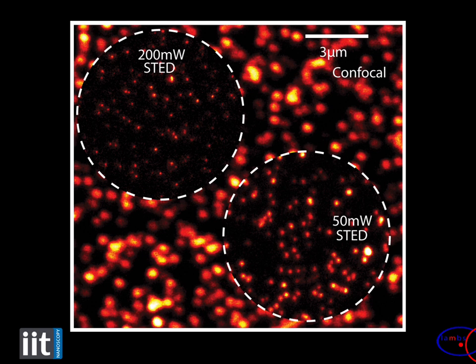One of them, since I'm from Genoa, is the cost of the laser. If you have to put a huge number of photons, you need high-cost lasers, and you cannot parallelize in case you want to speed up. The other, from the biological sample point of view, is that you could induce some photodamage or some fluorescence, because it's true that in the red your molecules do not absorb and emit too much, but it's not true that they don't do this at all. And so a very small number in terms of absorption cross-section can count if a huge amount of light is used.